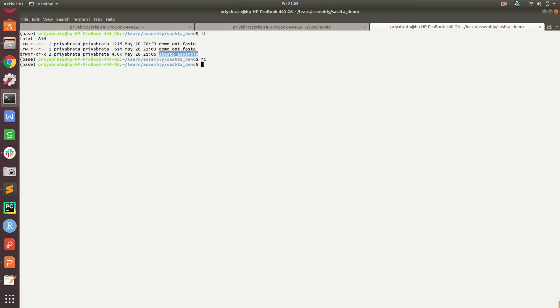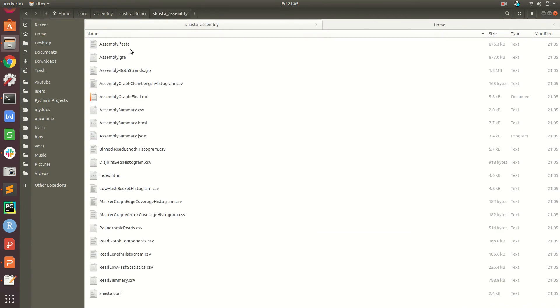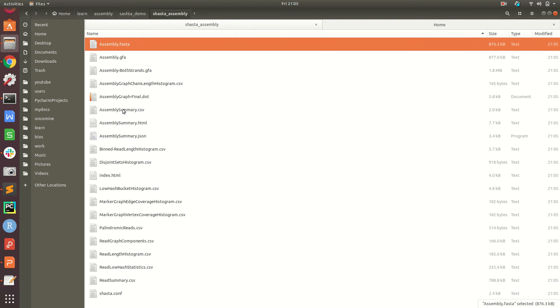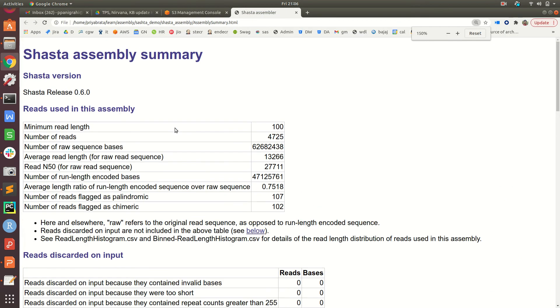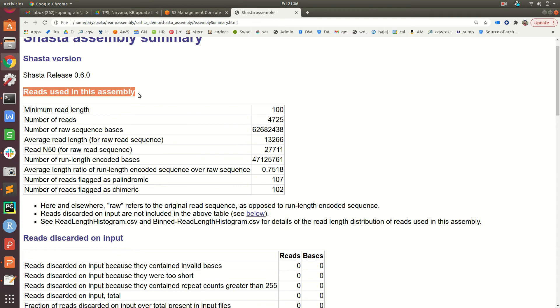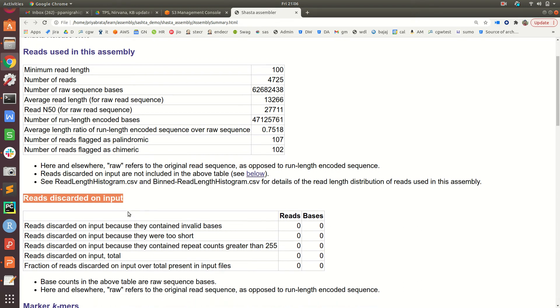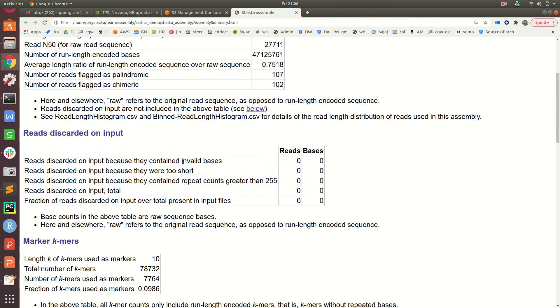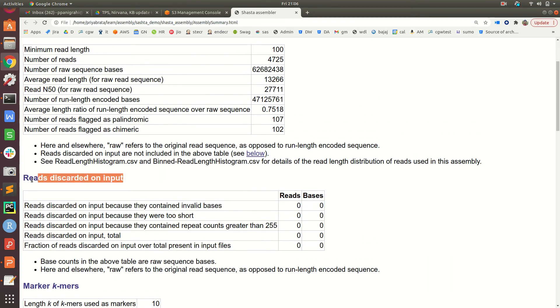Let's go to the output folder. Inside shasta_assembly we have the assembly.fasta file and other output files. There is also an assembly_summary.html file provided by Shasta itself. Opening it, we see two sections: reads used in the assembly process, and reads that were discarded based on the read length cutoff. Since I set the cutoff to 100, none of the reads were discarded in this run.